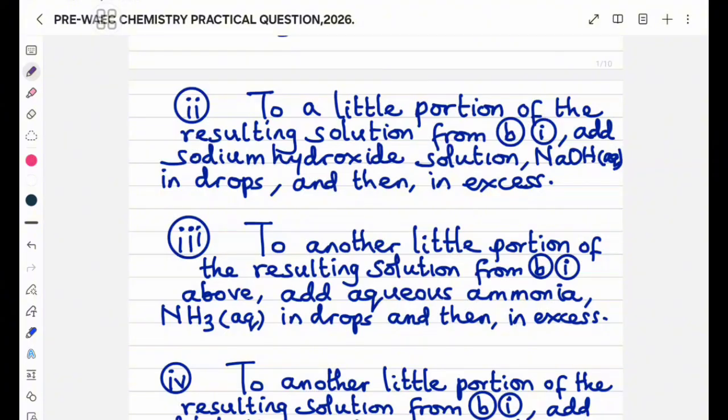So the mixture you obtain when you add dilute HNO3 to the residue will not give you a colorless solution. It will not give you a clear, colorless solution, no. And that's because of the presence of the starch particles. Most of the starch particles will interfere with the dissolution of that salt.